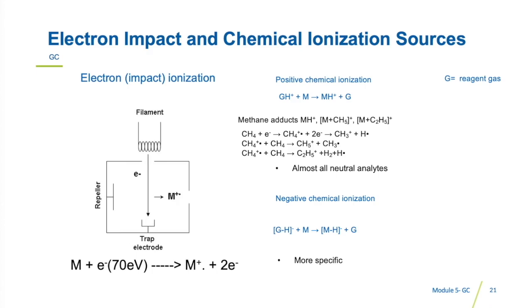When they meet, the remaining high level of energy causes a fragmentation of the analyte molecules. The first fragment is usually one where electrons are knocked off the analyte, but many smaller fragments are generated as well. It is the pattern of fragmentation, a highly reproducible process, that enables the identification of the compound.